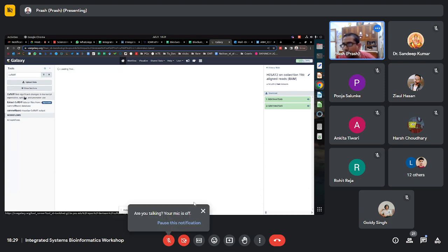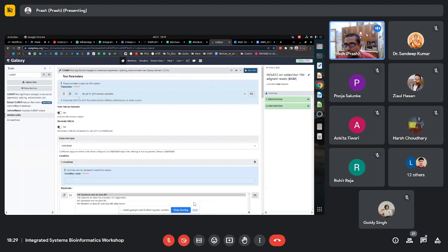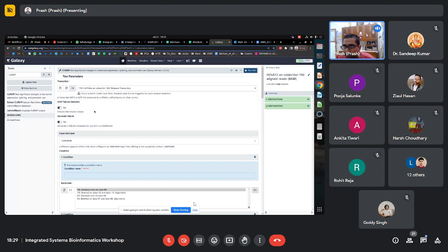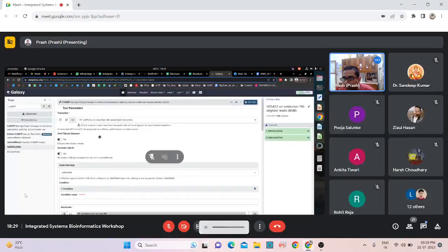And then here you take these transcripts. Usually, as I told you, there are two types of transcripts. One is assembled and the other is skipped transcripts that you get. It's still reading, one minute. So here you take this. Assembled transcripts you can take. This is number 131.